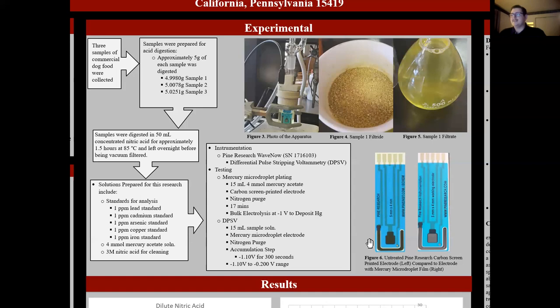On the left, you can see a standard screen printed electrode before anything has been done to it. That black square in the center is the working electrode, the horseshoe-shaped bar is the counter electrode, and the little silver dot on the right-hand side would be the reference electrode. On the left it is unadulterated, it has had nothing done to it, and on the right, you can see what has happened after it has been mercury micro droplet plated.